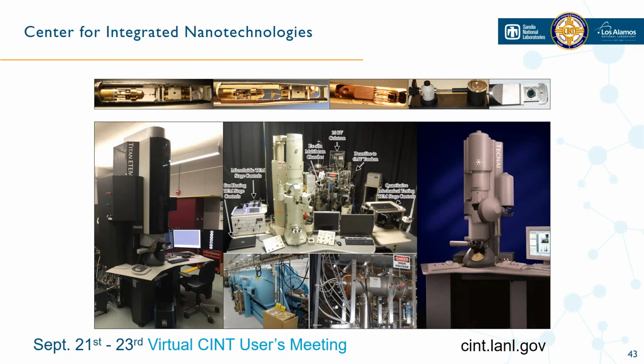We just want to finish up with making everyone aware that all these tools are available at the Center for Integrated Nanotechnology. So if you're interested, we do not have the K3IS. Unfortunately, we weren't able to keep it. We will have the K2IS, and we have a lot of variety in our in-situ holders, for heating, straining, liquid, gases, cryo, and then electrical biasing, electrochemistry, and then we have some custom platforms as well.